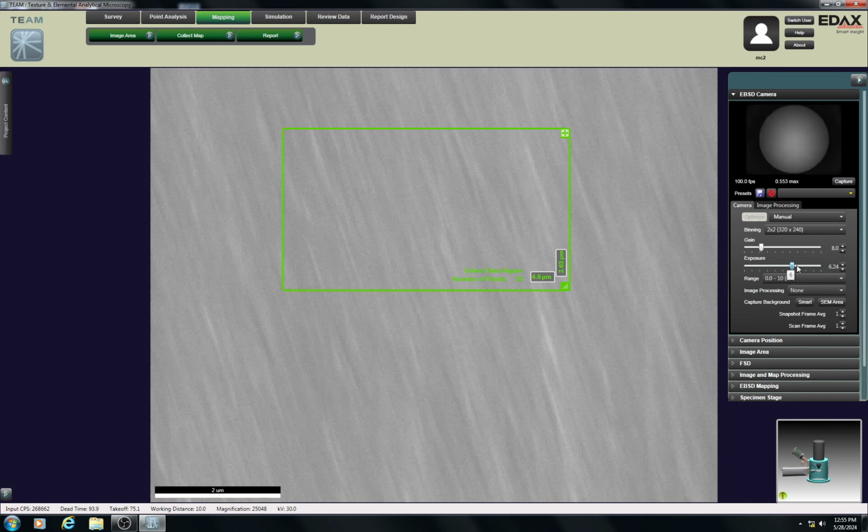I'm going to set my exposure. I have to go fairly high exposure because the binning is so small. There's different exposure ranges here. I don't think I showed this, but we'll go to the next longer exposure setting. And I'm going to drop the gain down quite a bit because I want this to be a real high quality picture. So no gain.